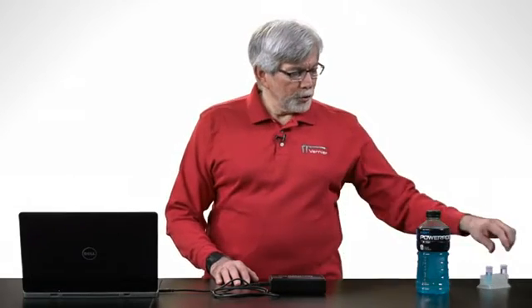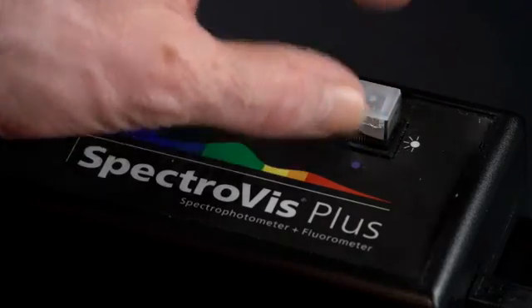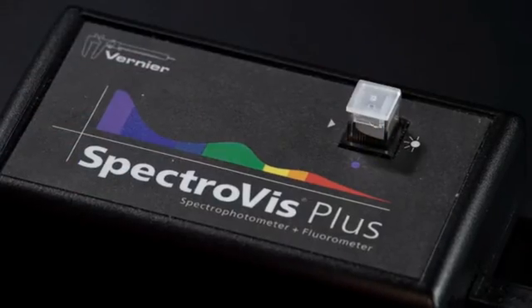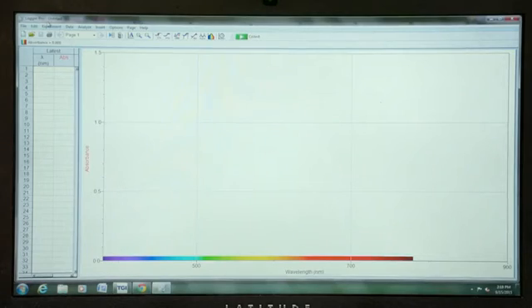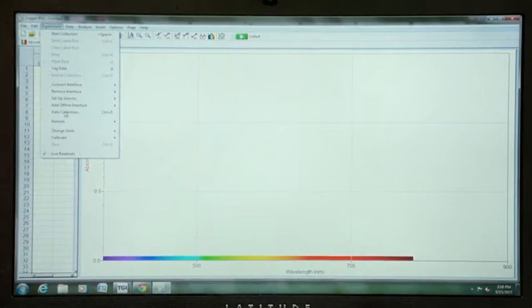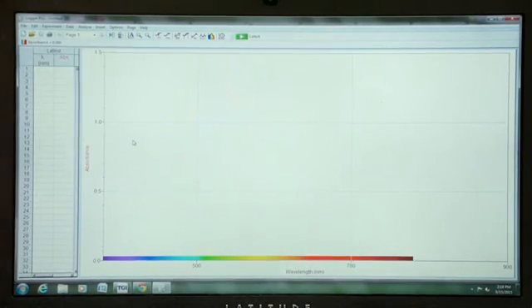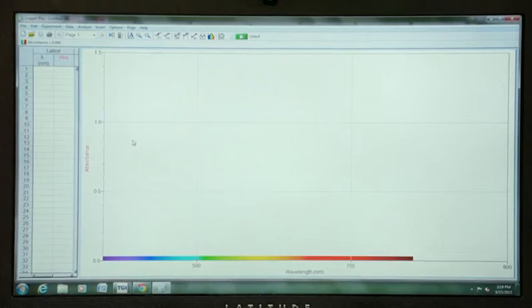The first thing that we will do is calibrate the SpectraVis Plus. To do so, we will use a cuvette of distilled water, our solvent, place it in the SpectraVis Plus, and then in Logger Pro, we will open the Experiment menu and choose Calibrate Spectrometer.